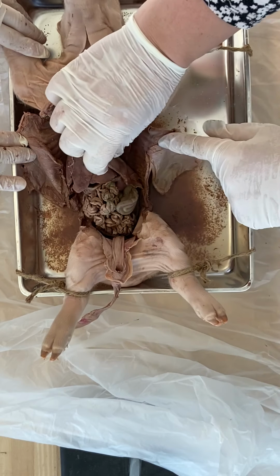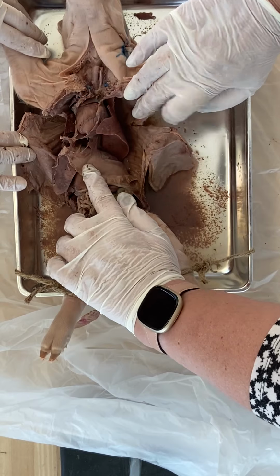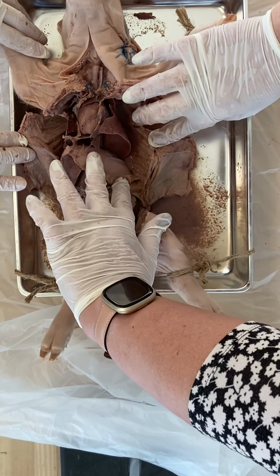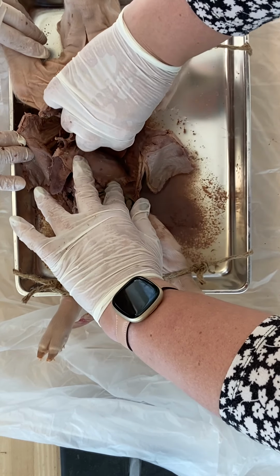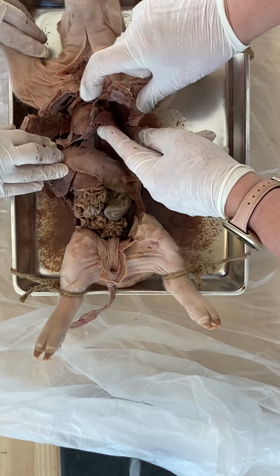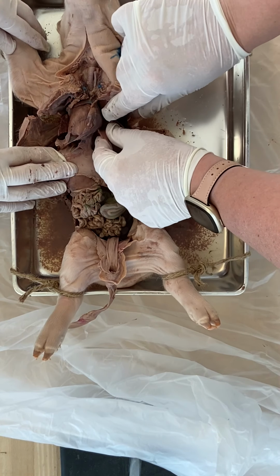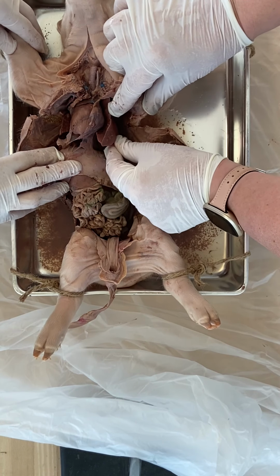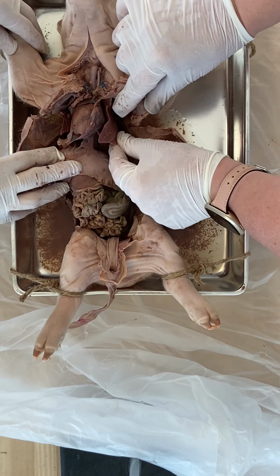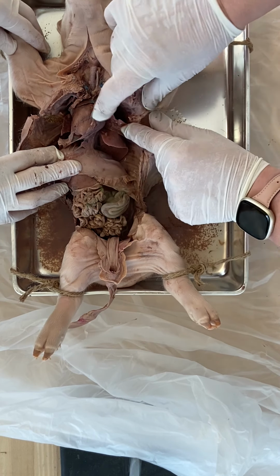We'll move that. So here's the diaphragm. That's a nice view of the diaphragm, too. Move the diaphragm out. That is nice. So there's the diaphragm. And here we have the piggy's left lung. It's soft but firm, keeps its form quite well, but it is soft. It is soft to the touch.